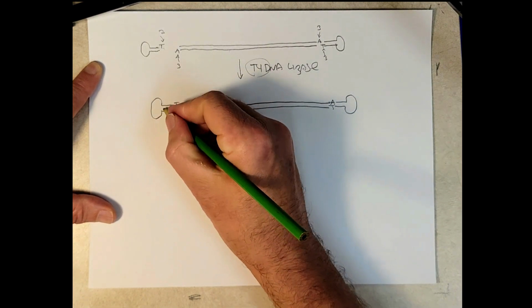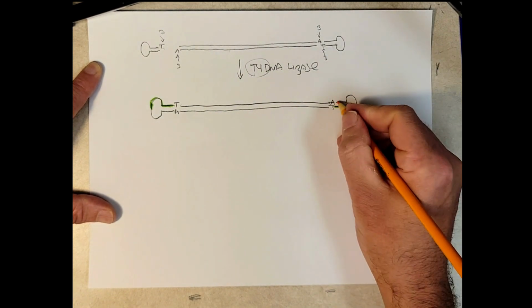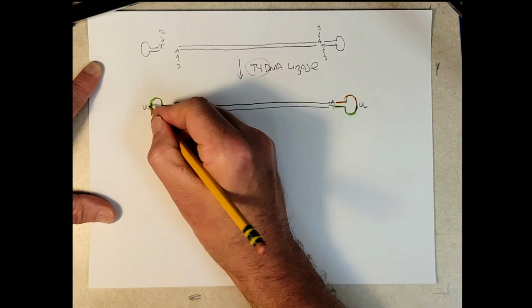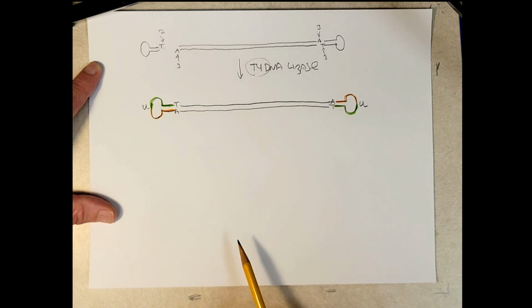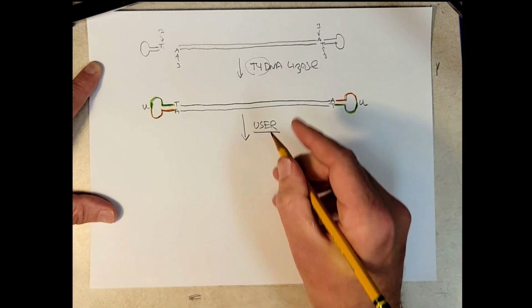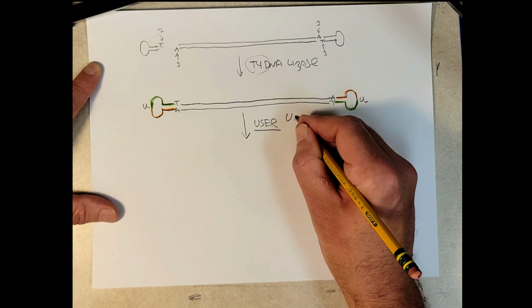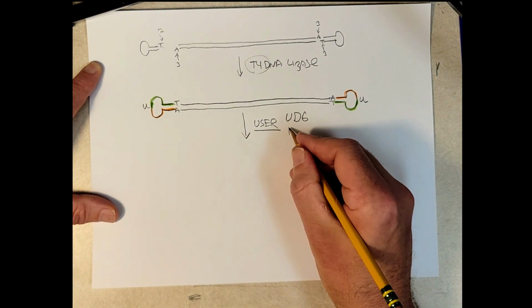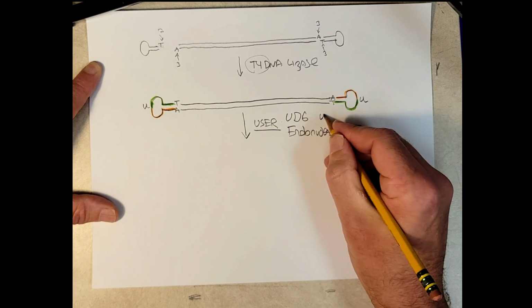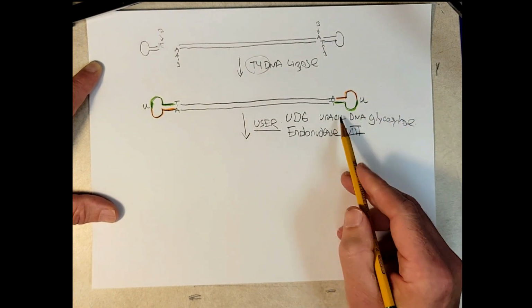And you know what? I can color this in. And by coloring it in, it'll help remind me that I forgot to put the uracils in there, didn't I? So all of our molecules should look like this at this point. Then we are going to add an enzyme mix that is called USER. I think that's what New England Biolabs calls it, but essentially it's just a mix of two enzymes, UDG and endonuclease 8. UDG stands for uracil DNA glycosylase.